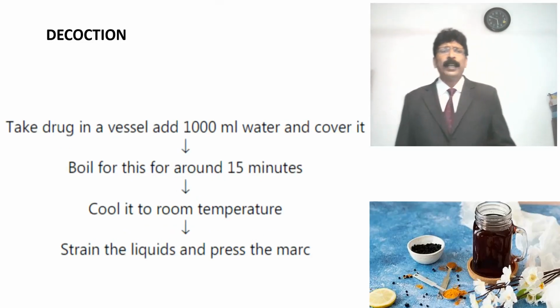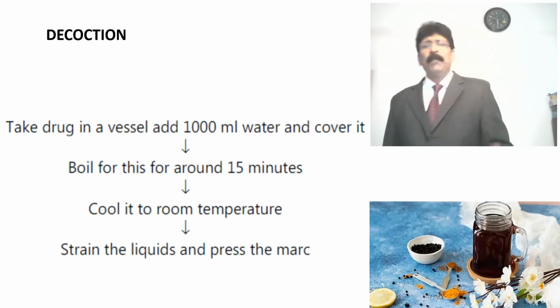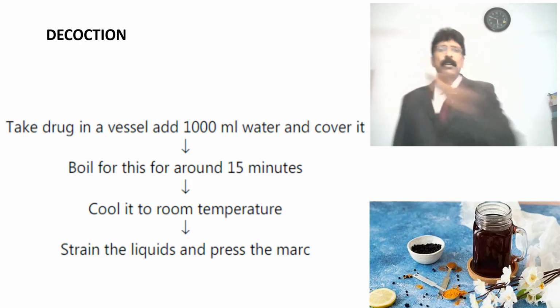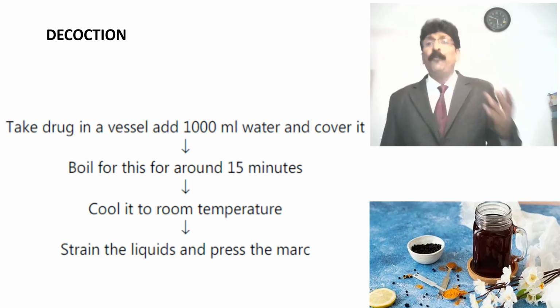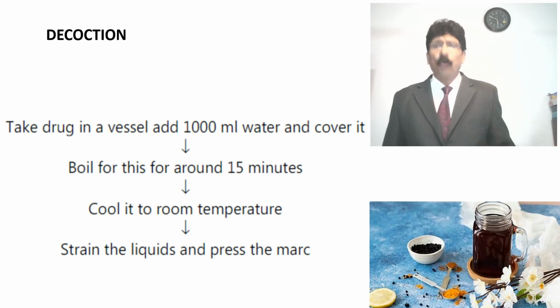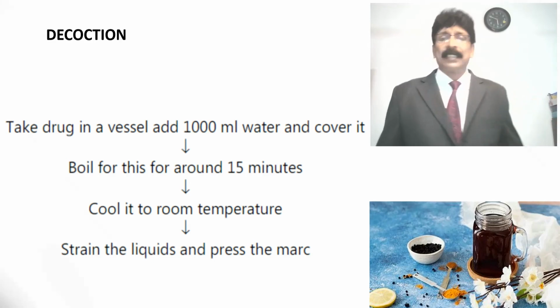Decoction, like the coffee which you prepare at home. Simple example: take the drug in a vessel, add 1000 ml of water and cover it, boil for around 15 minutes. Cool it to room temperature, strain the liquid and press the marc.